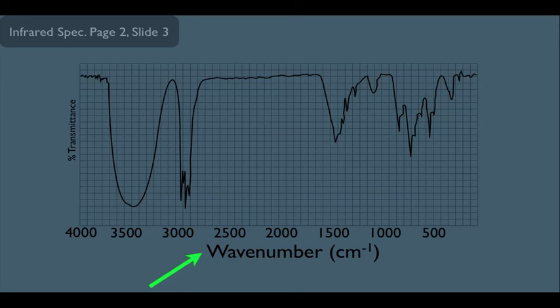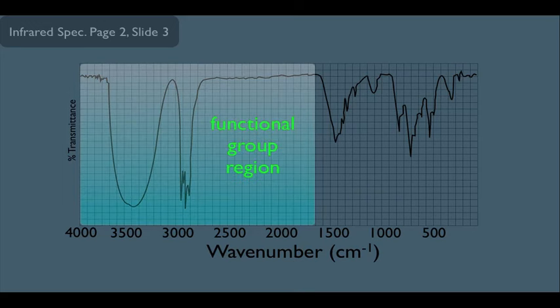And instead of thinking that absorption bands happen at certain frequencies, we can say absorption bands also happen at certain wave numbers. And just in case, let's know these wave numbers typically on the chart run from 4,000 all the way to zero. Some other basics about the IR spectrum here. Let's know that right about here, from 1800-ish to 4,000, is what's called the functional group region. This is where we're going to look for absorption bands that signal certain types of functional groups in the molecule.